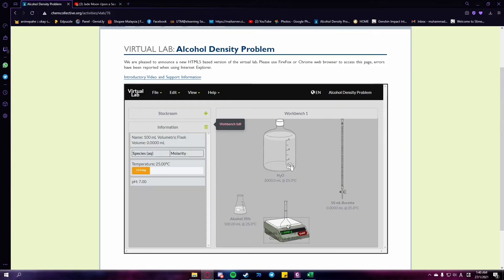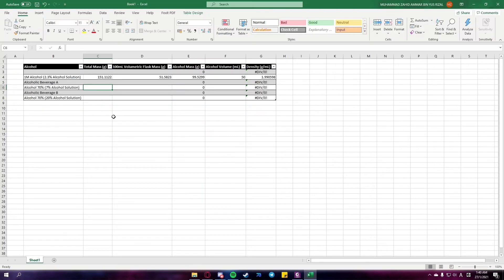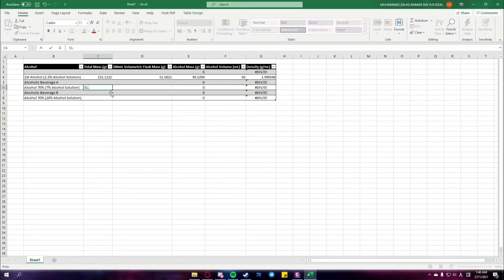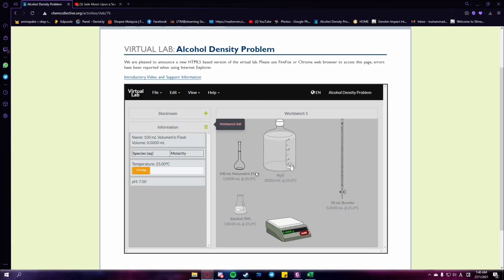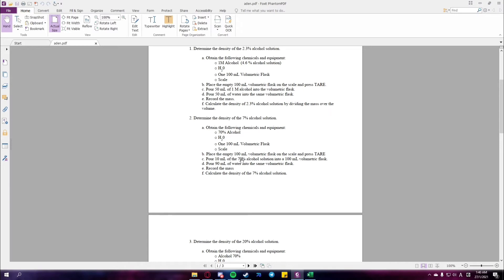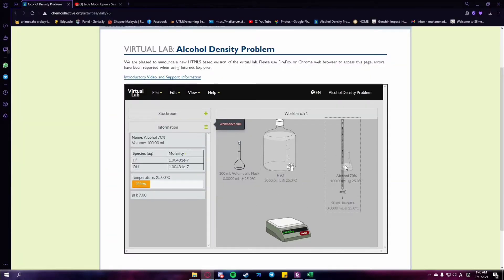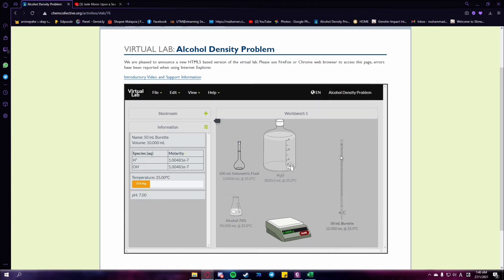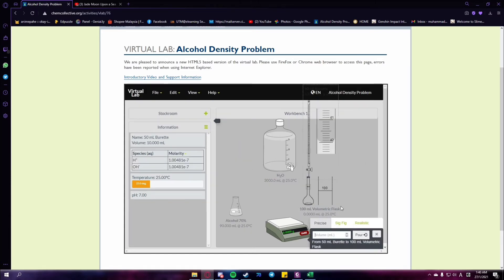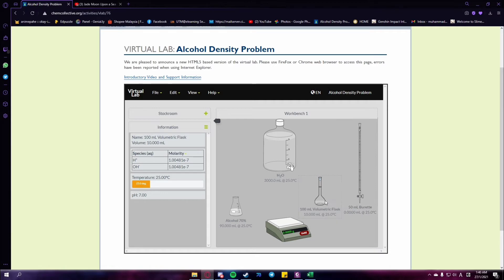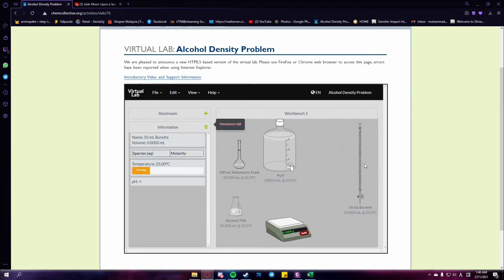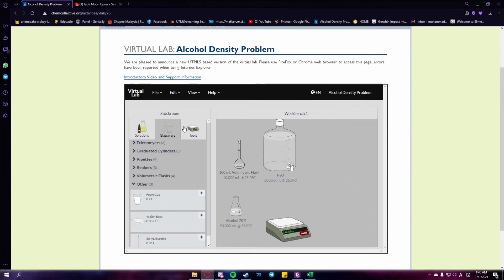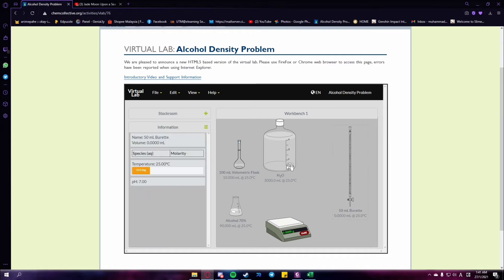The first step is the same as in procedure 1: record the mass of the empty volumetric flask. Next, pour 10 ml of 70% alcohol solution into the 100 ml volumetric flask. Then pour 90 ml of water into the same volumetric flask. After that, record the mass of the solution and calculate the density of the 7% alcohol solution.